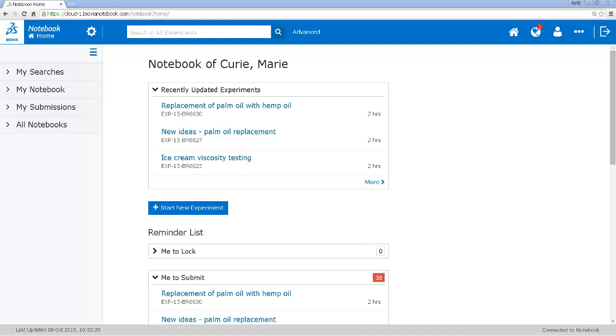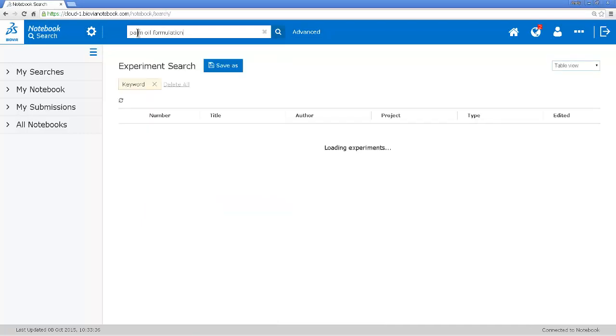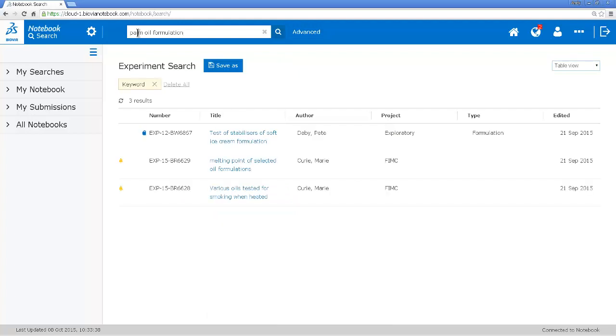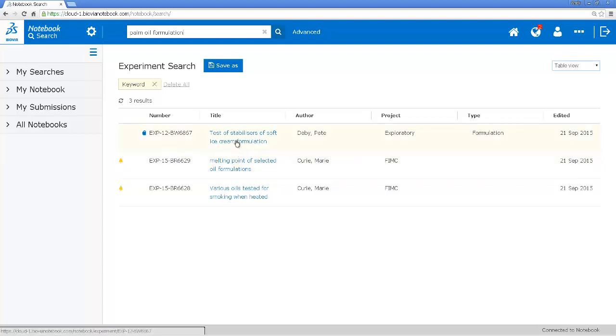So I'm going to search in the notebook for any palm oil formulations in my own experiments and my colleagues' experiments to see if there's anything that I can use. So I go to the search function in the notebook and put in the search. I could have added ice cream as well to the search terms but I found a few experiments. A couple of these don't look very useful - they're testing of different ingredients - but this one might be a useful experiment.